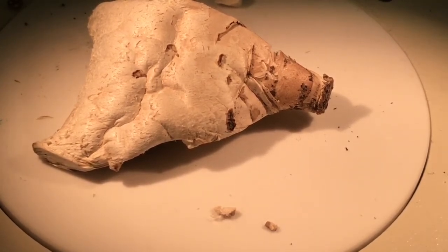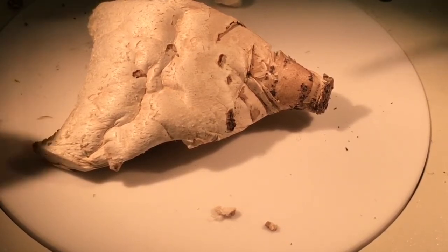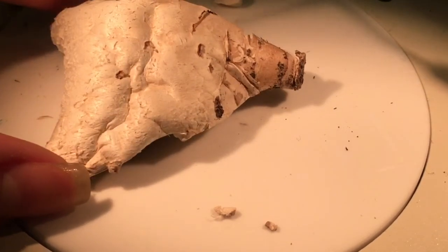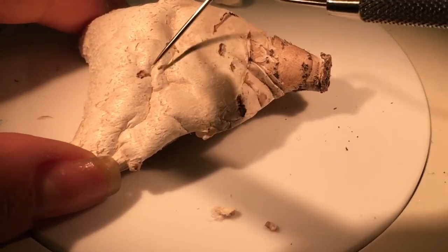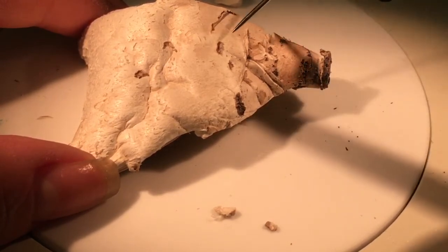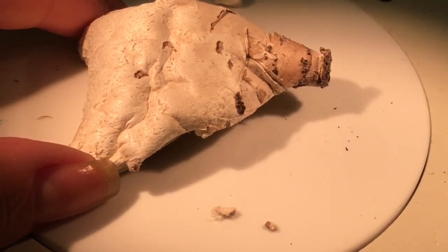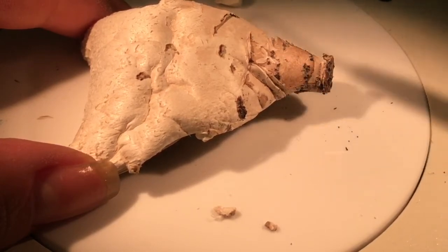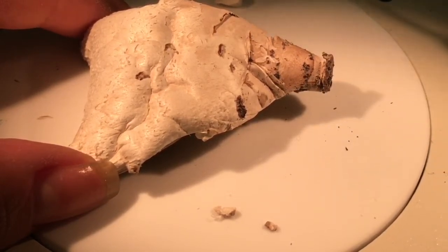In Amanita, the tissues that you'll be interested in are the universal veil on the cap, the pileus, and the pileus context. Now, because this is not Amanita, this is Chlorophyllum molybdites, it's important to make the distinction that these different elements that we observe here are not universal veil. These are squamules or scales, and they are part of the pileus covering. However, the techniques that I'm going to use to section through them are exactly the same that I use in Amanita.